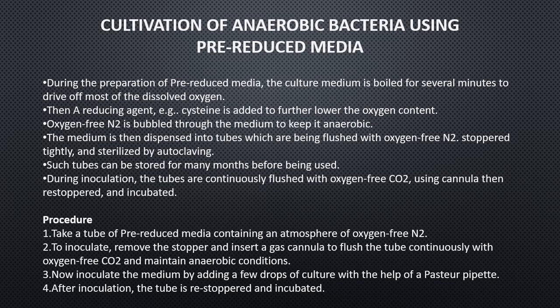If you prepare them in your lab, try to flush your media with oxygen-free nitrogen to drive off the oxygen, or even oxygen-free carbon dioxide, so that the concentration of carbon dioxide in your medium is increased. It depends on what works best for you.